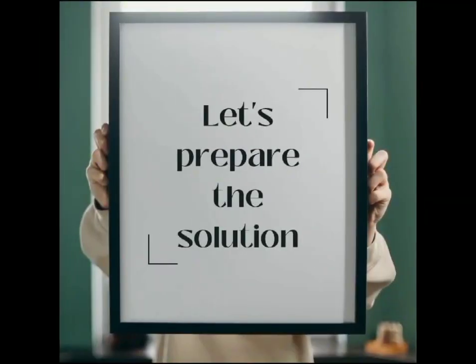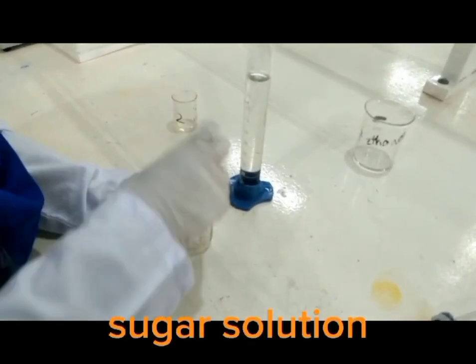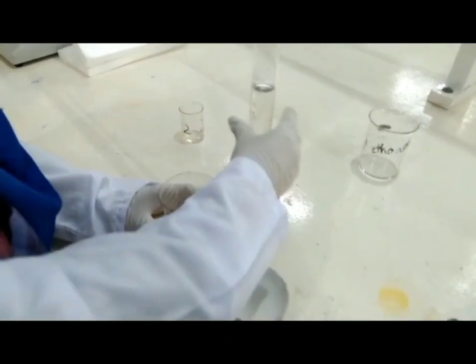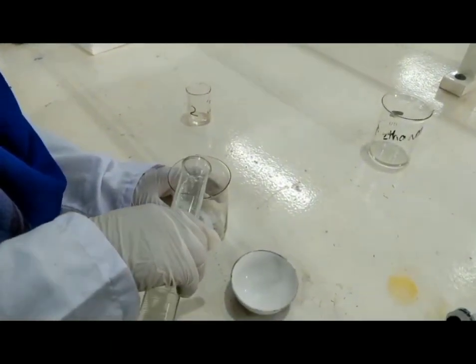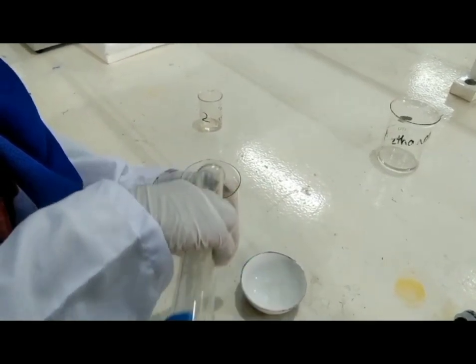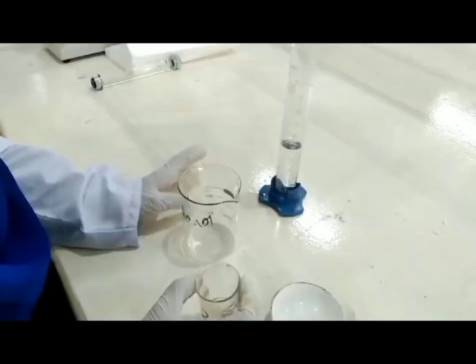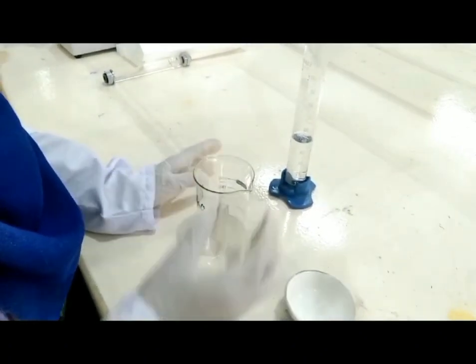Let's prepare the solution. First we prepare the sugar solution. We add the sugar in the beaker, then raise its volume to 100 ml. After this, we prepare the HCl solution.